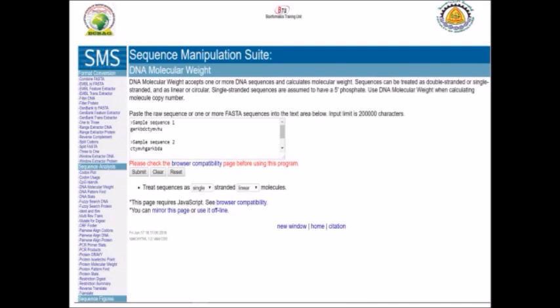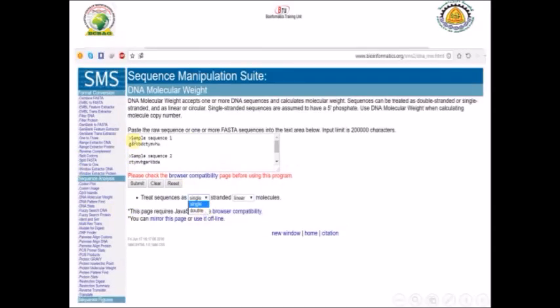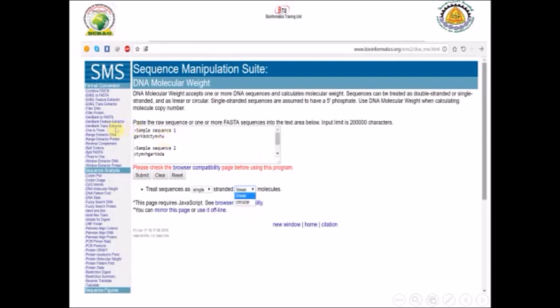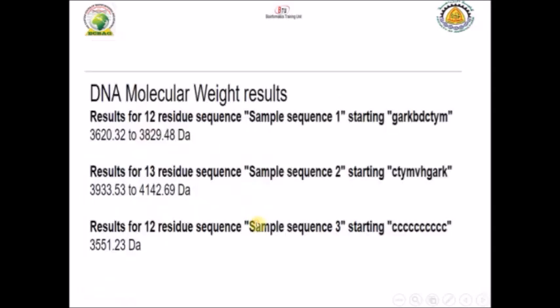In the submission box you can put your sequence in RAW or FASTA format, and you can put one or more sequences as we said. You can choose to treat your sequence as single strand or double strand, and also as linear or circular. These are the main options that you can choose from.